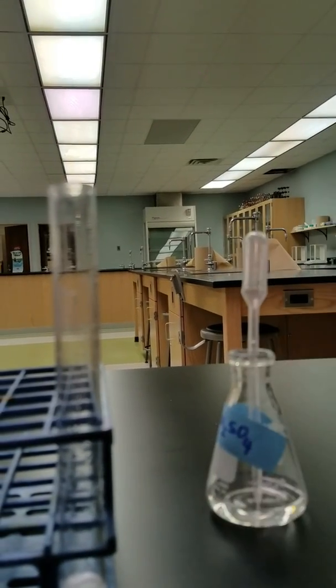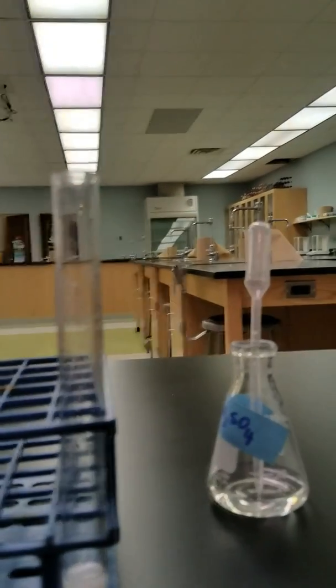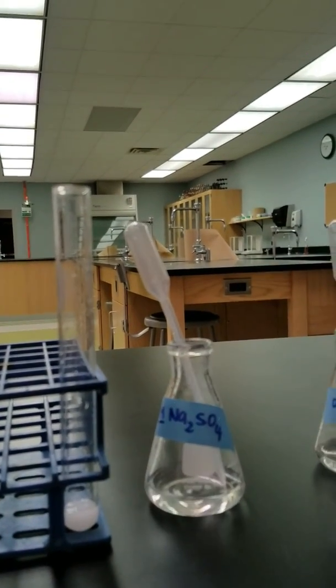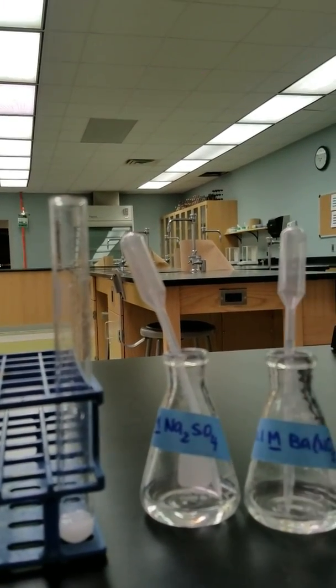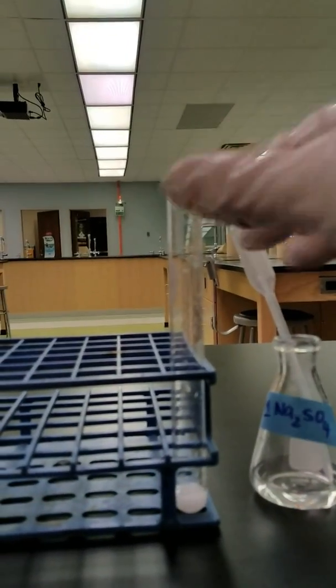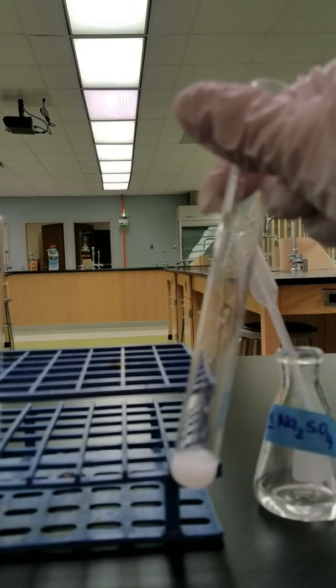Two clear colorless solutions, but upon mixing, what do we see? Here's what they looked like initially, right? There's sodium sulfate and barium nitrate, clear and colorless, clear and colorless. But when we mix them, we get a white precipitate.